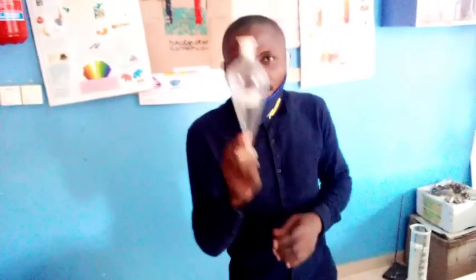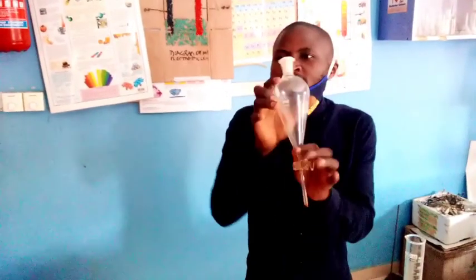Then we have the separating funnel. This is used for the extraction and separation of two immiscible liquids. This is called a separating funnel. It is used in the separation and extraction of two immiscible liquids. For instance, petrol and water are immiscible. Any polar solvents and non-polar solvents, solvents that have different characteristics, are immiscible.